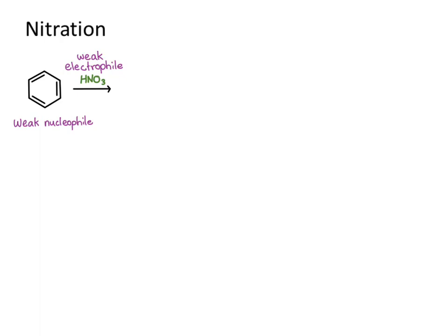So what we do is we use sulfuric acid to make the nitric acid more reactive, right? A better electrophile. And the product of this reaction would be NO2. Let's see how the sulfuric acid activates the nitric acid. It is the structure of the nitric acid, right? It's a neutral compound. It has positive and negative, but overall charge of nitric acid is neutral. Nitric acid is an acid, which means it can donate the proton readily.